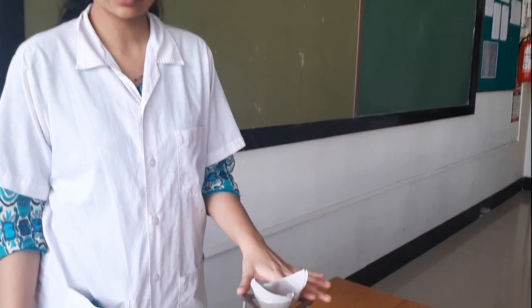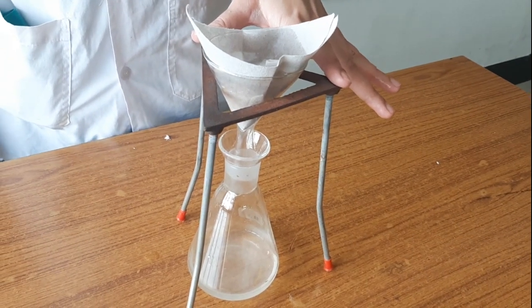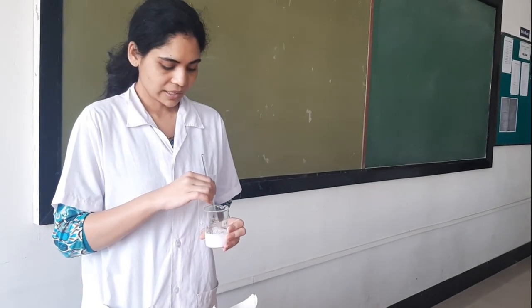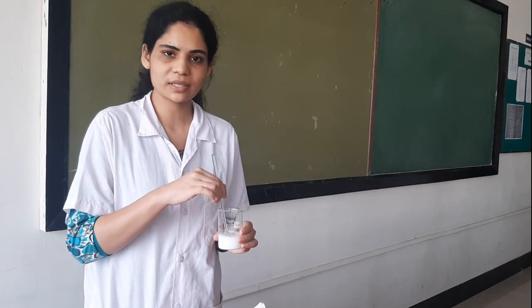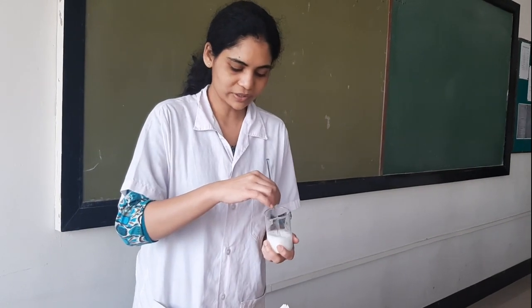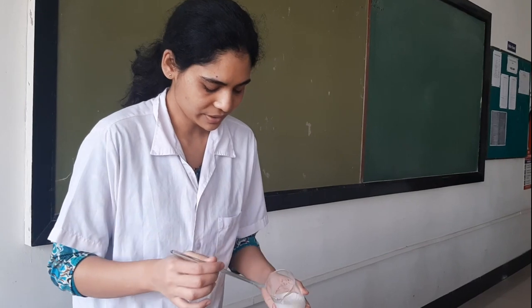So now, as you can see here, we have completed the process of filtration, and it took us 10 minutes and 16 seconds for the whole process. Now we have taken our last 15% volume by volume solution of glycerine slurry of calcium carbonate. Okay, now we will pour it through the filter medium, and we will determine what time it requires for complete filtration.